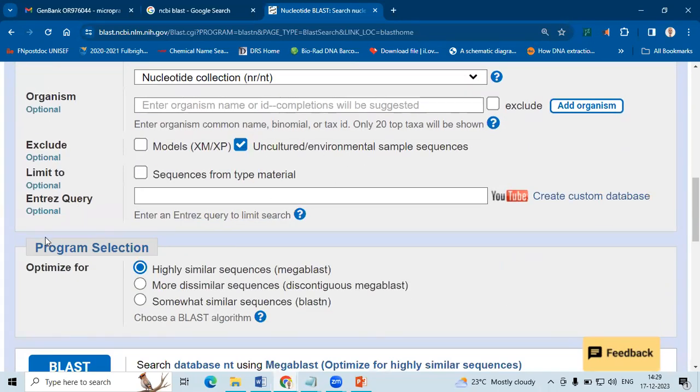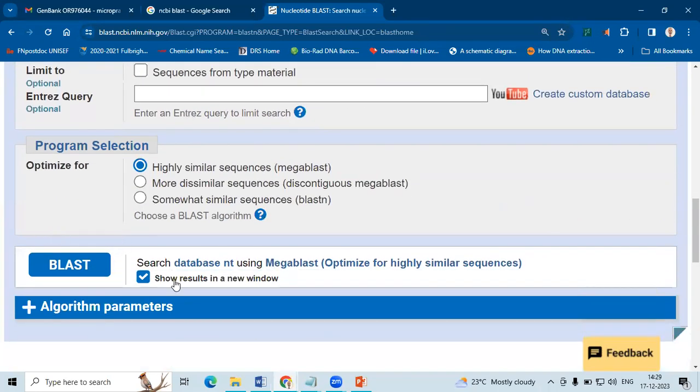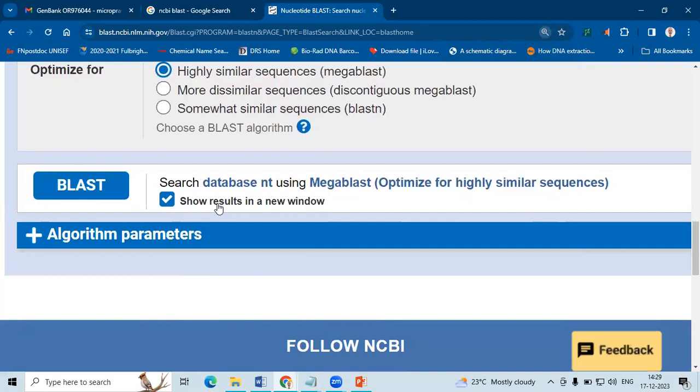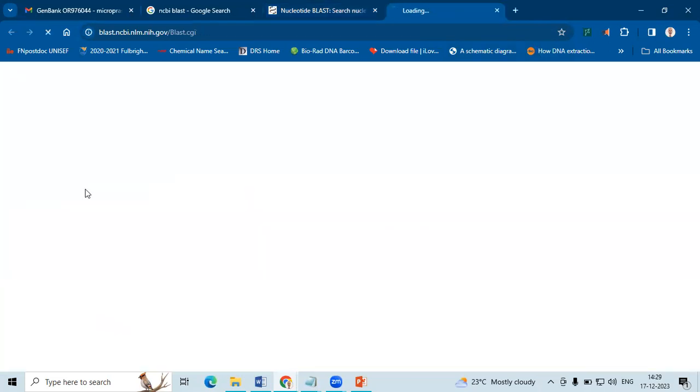exclude the unculturable, we don't want to see them. So usually I select show results in new window, click BLAST.